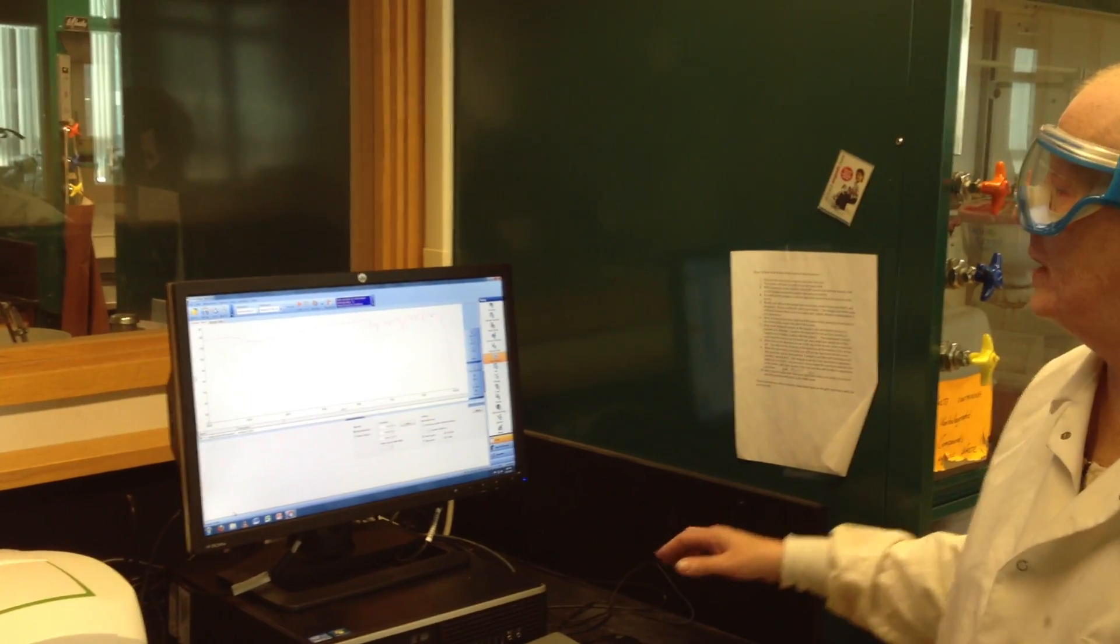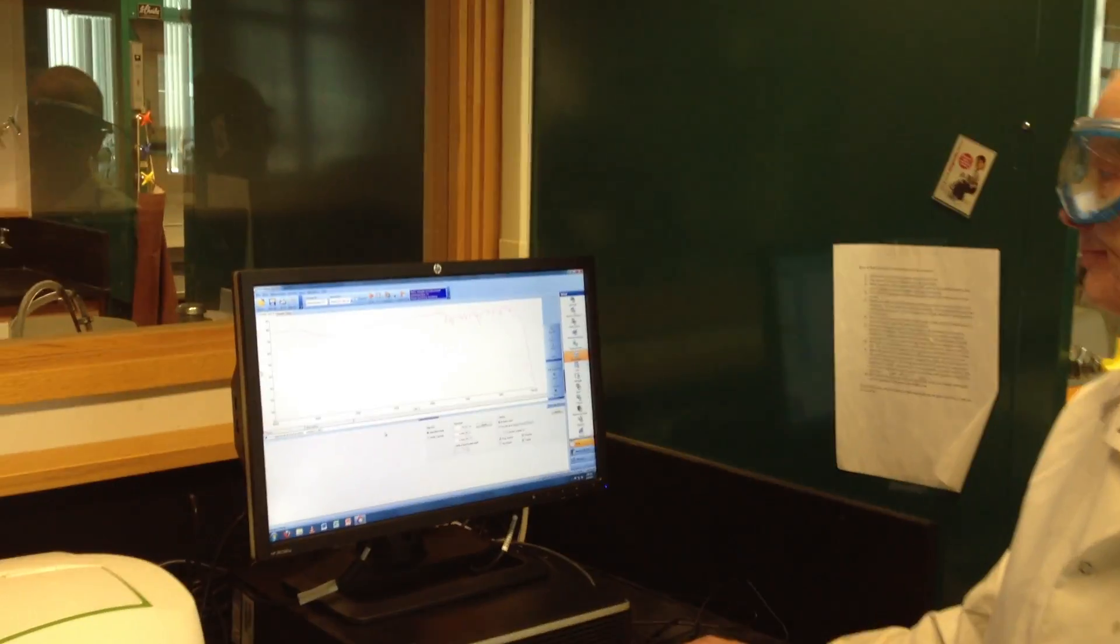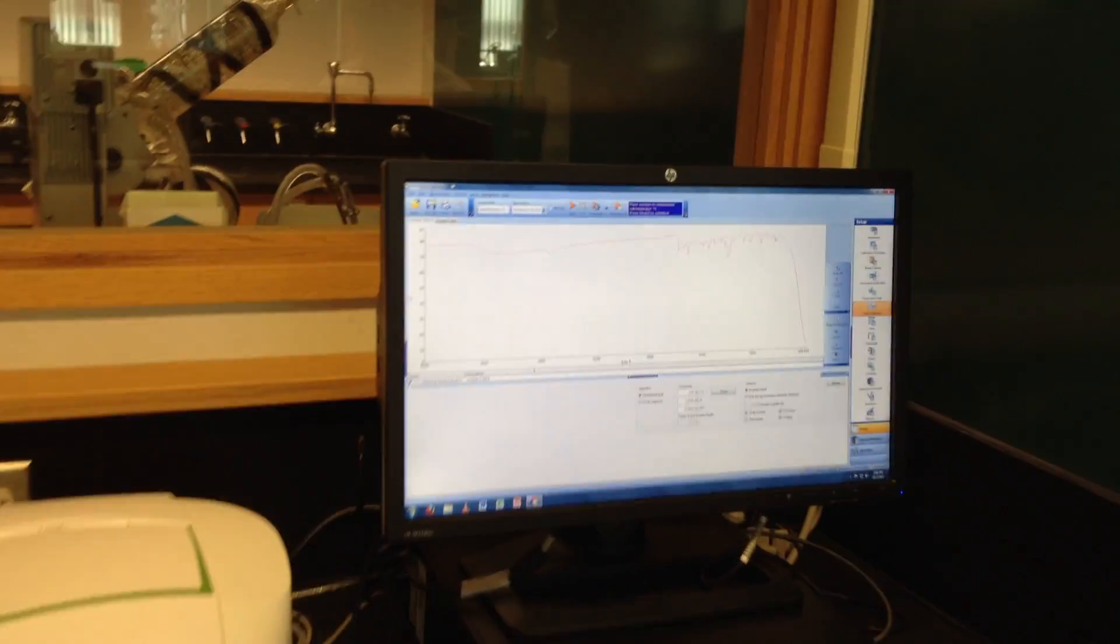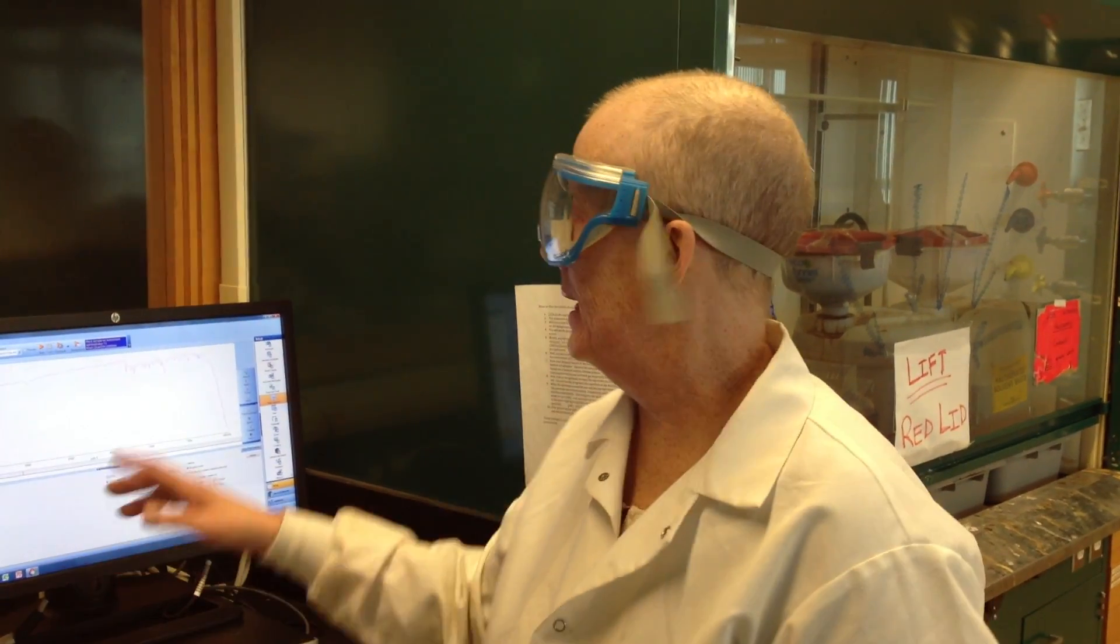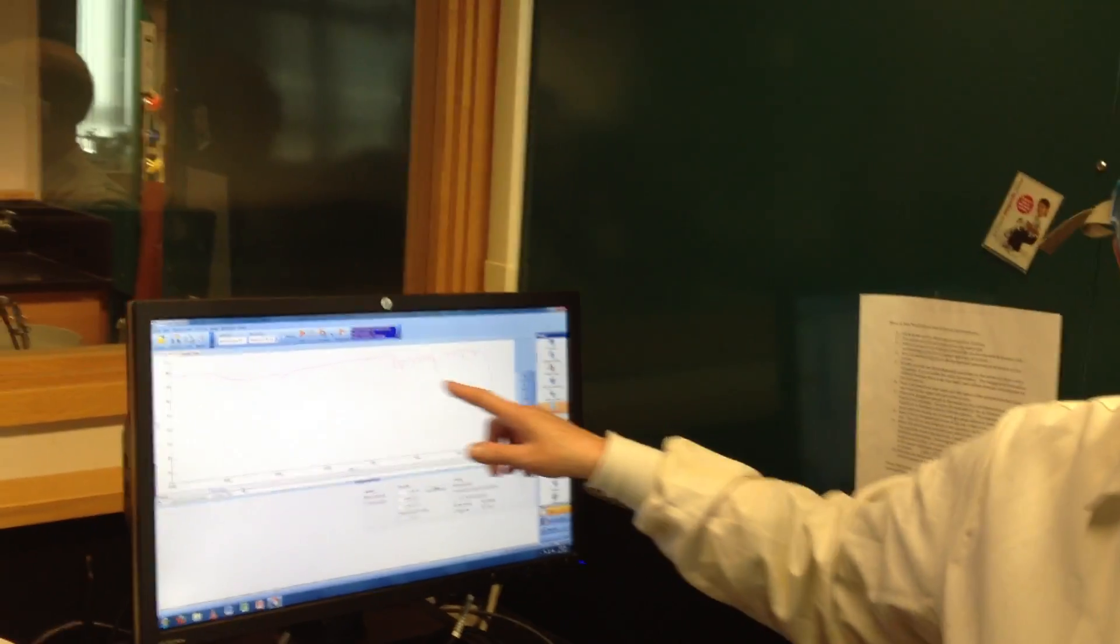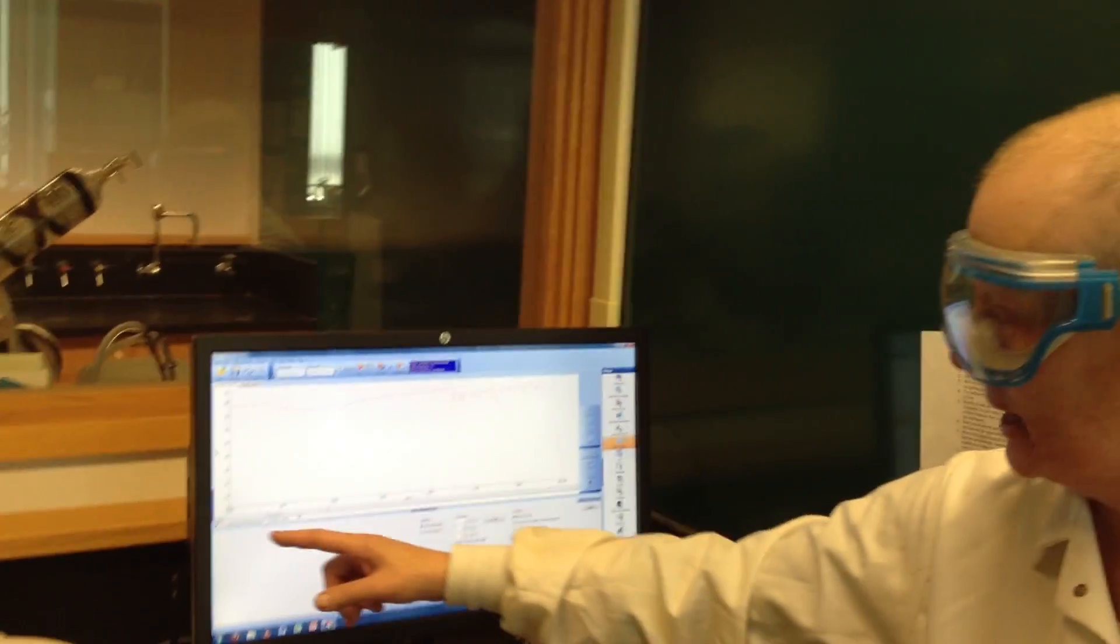Notice, were I going to run it again, one of the interesting things about this instrument is that if you run it again, like if you scan it again, or say I took the sample out and I put more compound on it because I wasn't happy with it. If I did that and I ran it again, it would superimpose the next spectrum on top of the spectrum and kind of keep a running list of all my spectrum on the bottom. You can kind of manipulate it and get rid of spectra at your discretion.